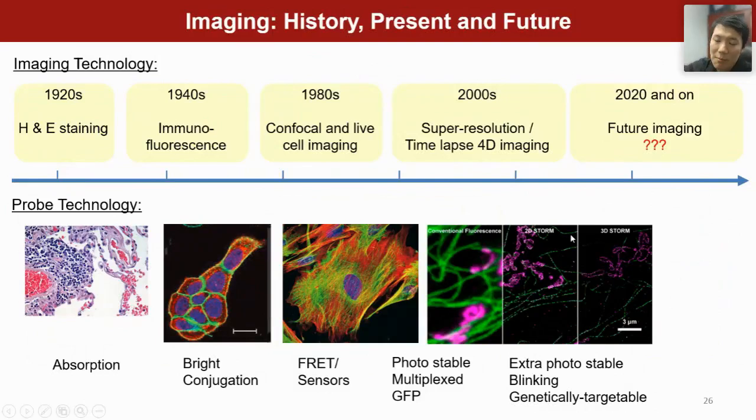But if we come back to the very first question I asked, I'm constantly thinking, what's the future of bioimaging? And I think I have a tentative answer. I think with super resolution, maybe in the future, like 20 years later, people will be doing 4D super resolution imaging.